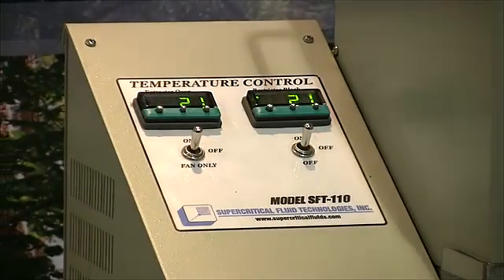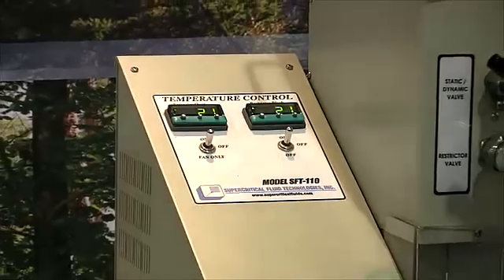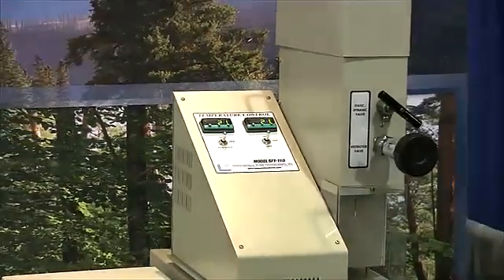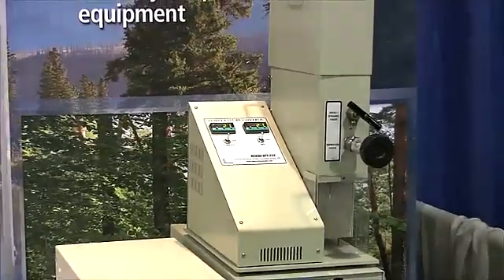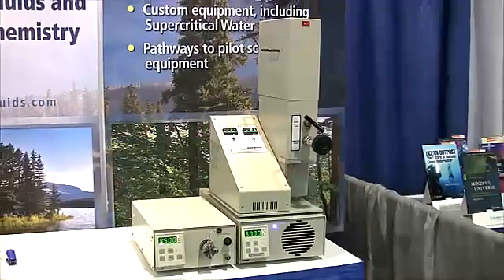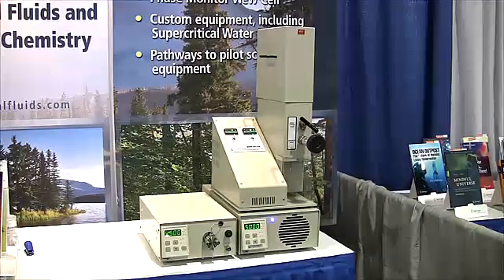The SFT110 Supercritical Fluid Extractor is the most popular SFE system in Supercritical Fluid Technology's line of extractors. Building upon the solid performance of its predecessor, the SFT100, the new 110 is now the state of the art SFE for research and process development.